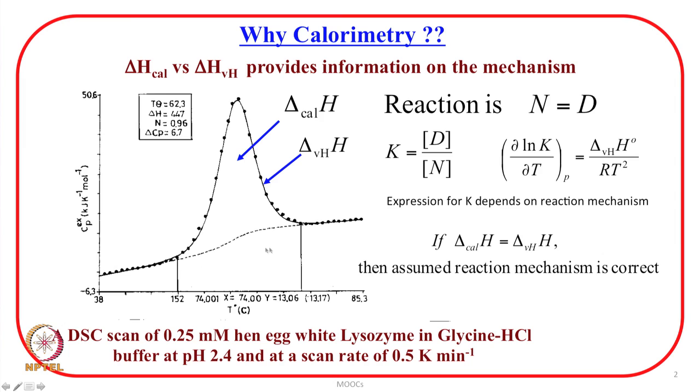If the transition is very sharp, then it will come like a spike, because generally at phase transitions all the heat which is supplied is used up to bring about the phase transition rather than changing the temperature, and heat capacity becomes infinite. But since here we are talking about the protein system, in which this transition from folded to unfolded state is not like a solid liquid kind of phase transition, that is why it is not very sharp.